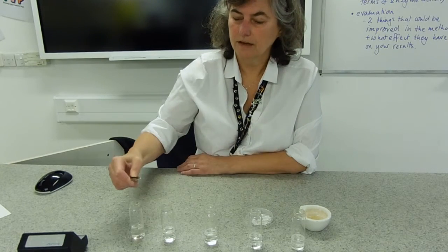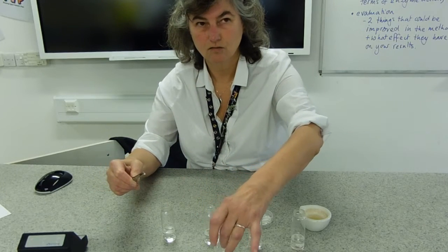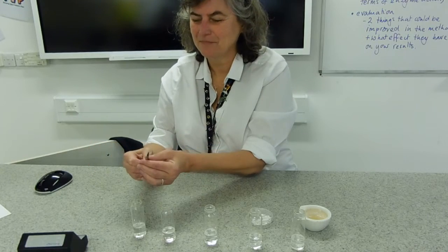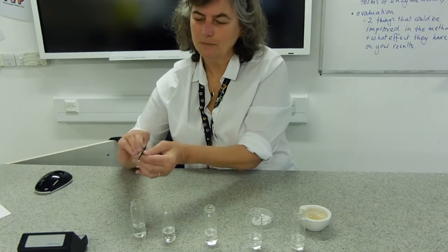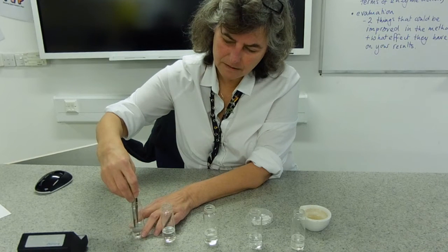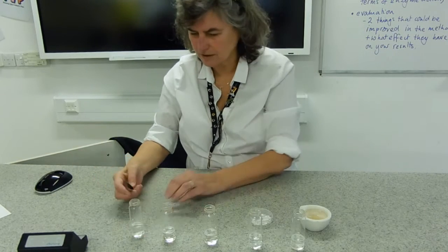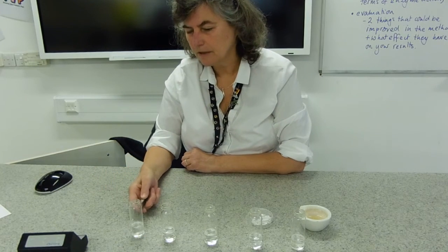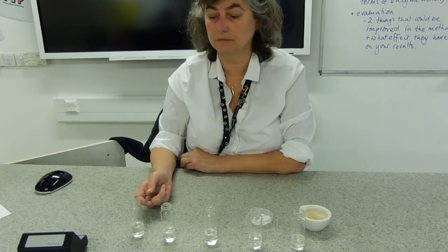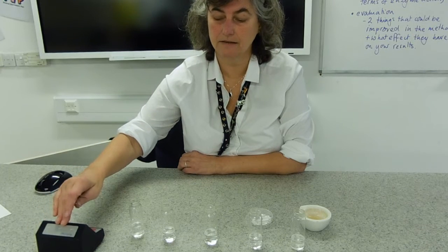We soak the chad in the enzyme solution — that's where the enzyme is. Then we drop it into the substrate solution, which is the hydrogen peroxide. The disc is heavier than the hydrogen peroxide and sinks to the bottom, but as oxygen is released from the reaction, you can see it pops back up to the surface. I've got my timer here to time how long that takes.